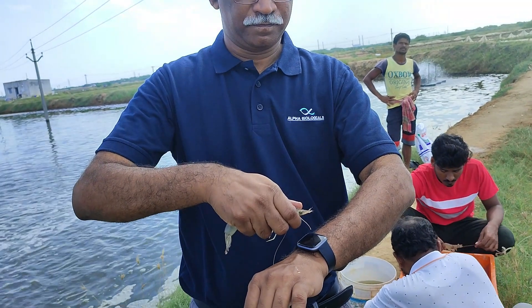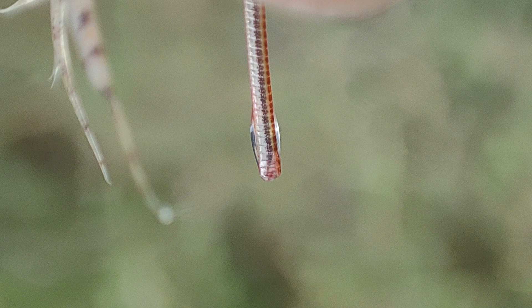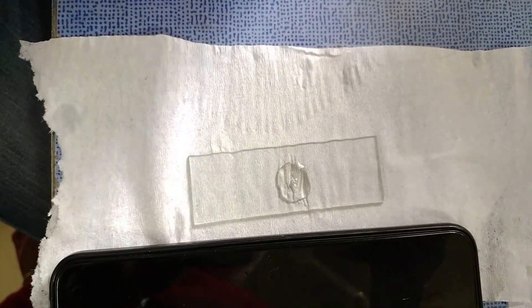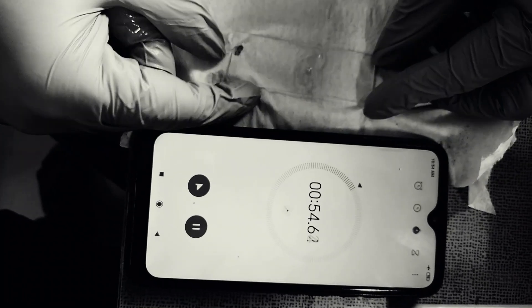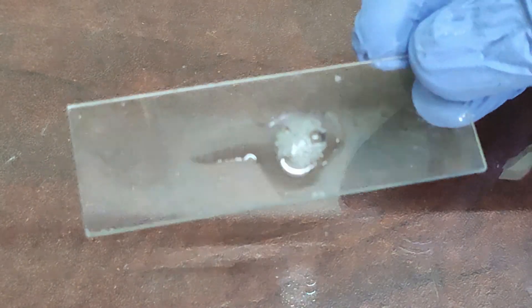Collect the blood on the watch glass — it is non-destructive and the shrimp survives. Place a drop of blood on the glass slide or watch glass and note the blood clotting time. It is considered healthy if the clotting time is less than 30 seconds. If the clotting time is more, it indicates either severe stress or a disease condition.